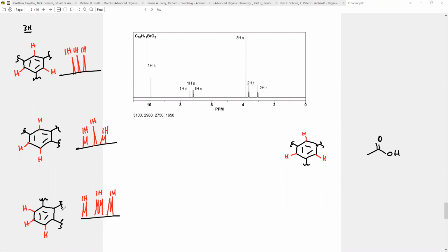The next question we'll consider 4H arrangements. So we'll cover that. And then we could technically do a 2H arrangement. Well, maybe we'll cover that in the next one. We'll see. But again, I don't really want you guys to sit here and write these down and memorize them. I just want you to understand the intuition we have behind understanding, if I see certain peaks here, how I can translate them into an answer.